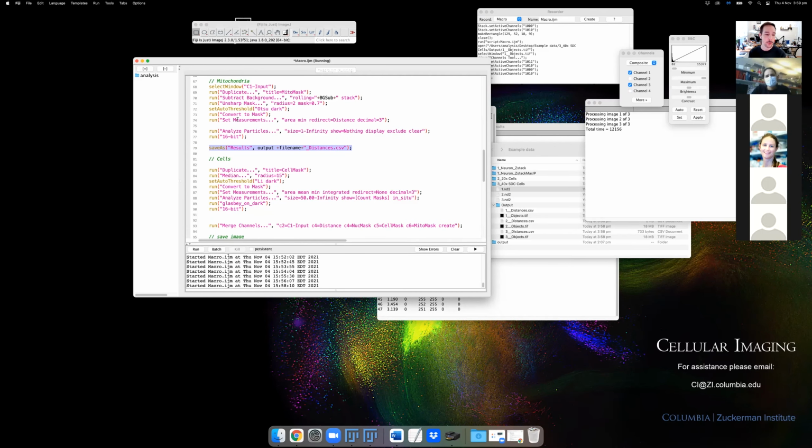Because what I'll probably do is share a link with the scripts that we worked on today, so you have something that's working. And I'll include that little bit at the end for this one, so that you could see how you could get this whole thing working for the cells as well.